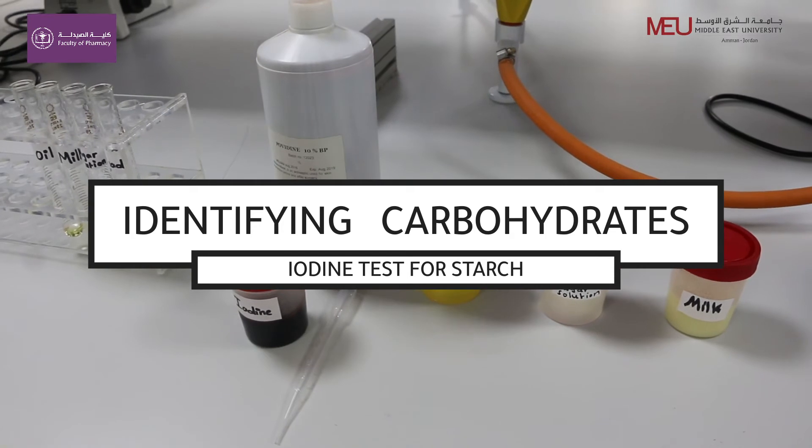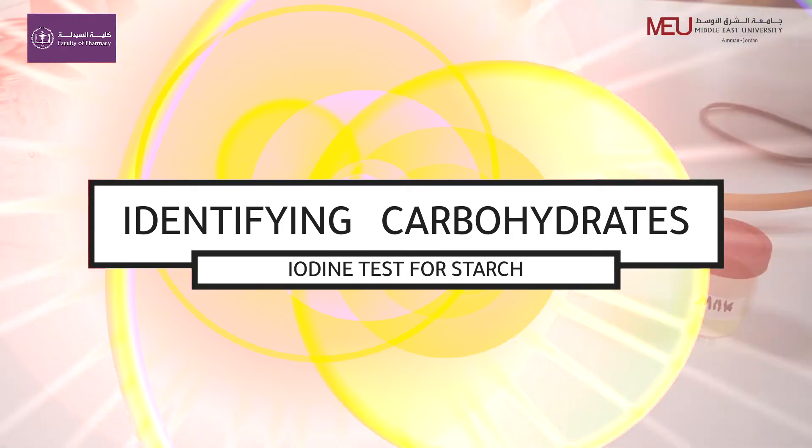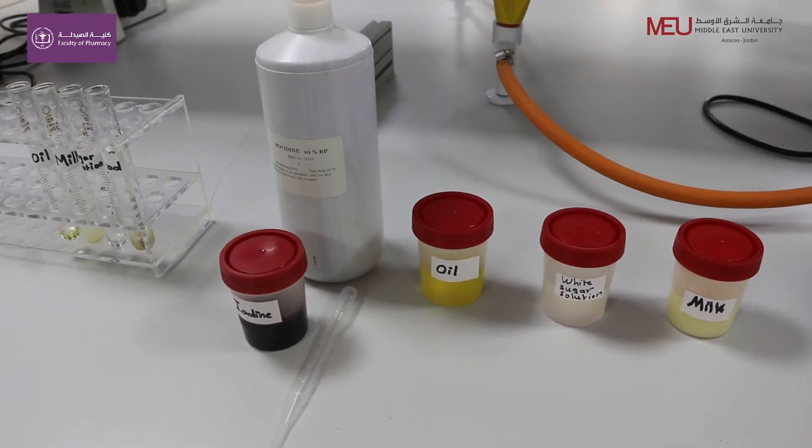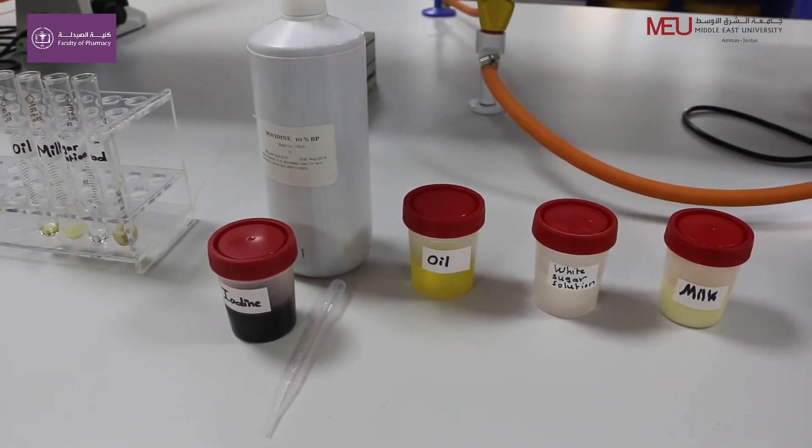Iodine test for starch. When starch is mixed with iodine in water, an intensely colored starch-iodine complex is formed.